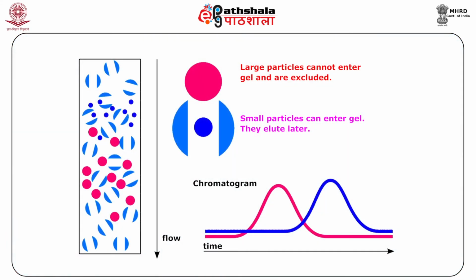As I just mentioned, gel chromatography is going to utilize the physical property which is the size of the molecule. So, gel chromatography is also known as size exclusion chromatography or molecular sieve chromatography. We shall learn why these two names are given to gel chromatography. It uses the size of a protein to separate it from other proteins. Now, the solid phase in this chromatography consists of beads with pores of defined size.